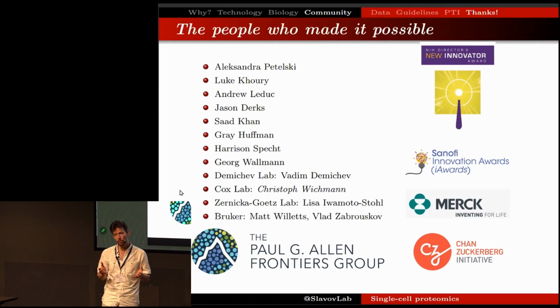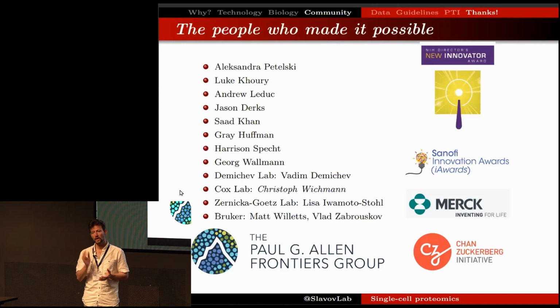Imputation is going to make some assumptions. So the best we can do is know what is the generative process for that missing data, so that the imputation takes into account the generative process. For example, in shotgun data acquisition, a lot of the missingness is random because it depends whether a precursor was selected for MS2 or not. Especially when using a carrier, a lot of missingness is at random. In other cases, the missingness is due to abundances being below the limit of detection. And then the imputation method has to take that into account, has to be a different imputation method.